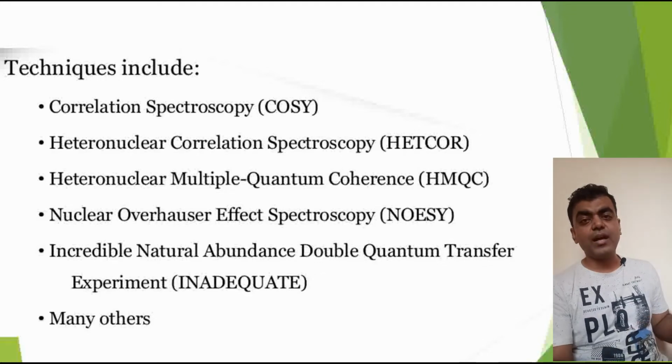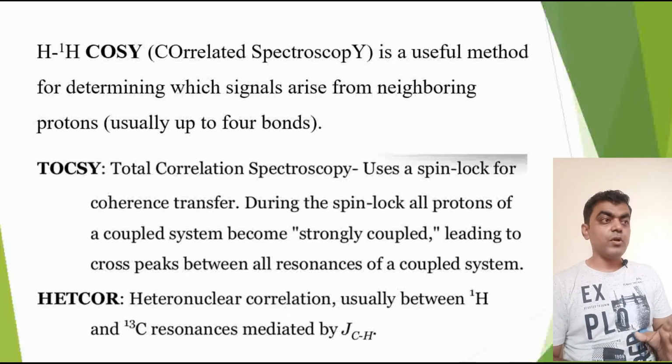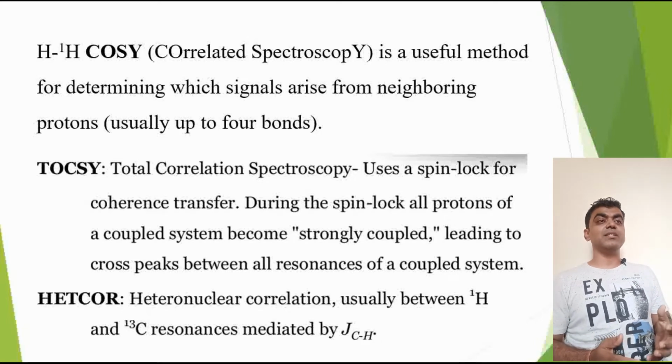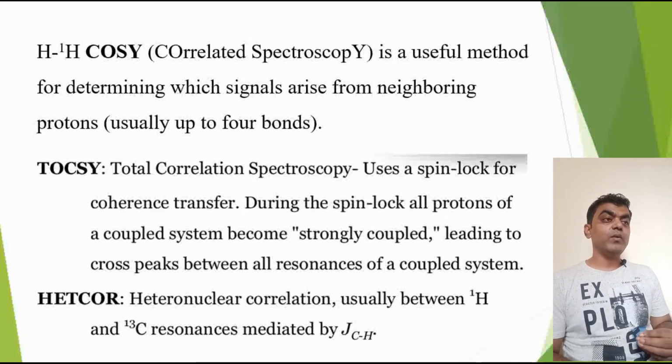And there are several other experiments like this. So COSY, correlation spectroscopy, is a proton-proton correlation. It can be cross correlation also, but usually it is done with the proton-proton correlation spectroscopy, and it is a very useful method for determining which signals arise from neighboring protons.